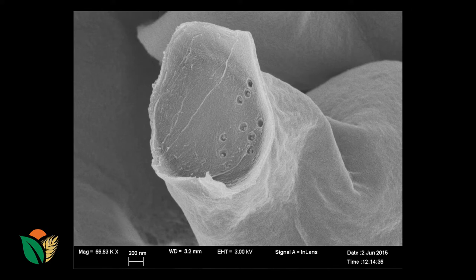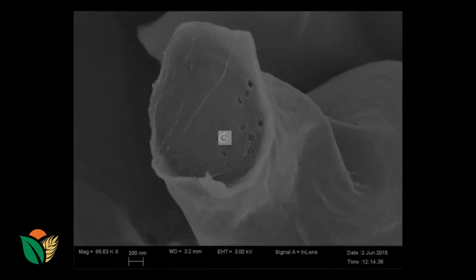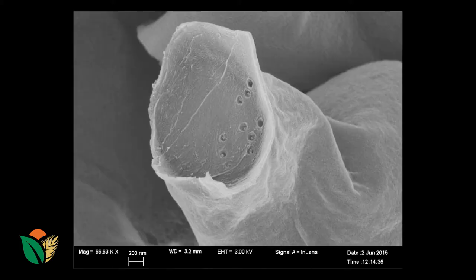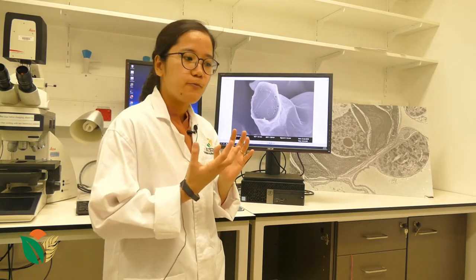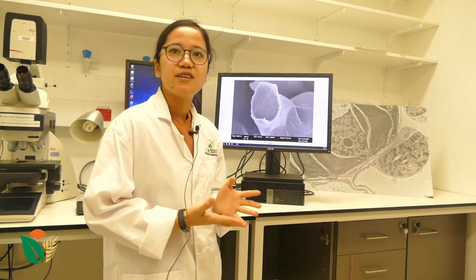Here you can immediately see that we can count them easily. These structures, which look like a target, you can count: 1, 2, 3, 4, 5, 6, 7, 8, 9, 10 structures. This is really important for me because I am working on a comparison between photosynthetic types such as C3 and C4, where C4 is more photosynthetically efficient than C3.